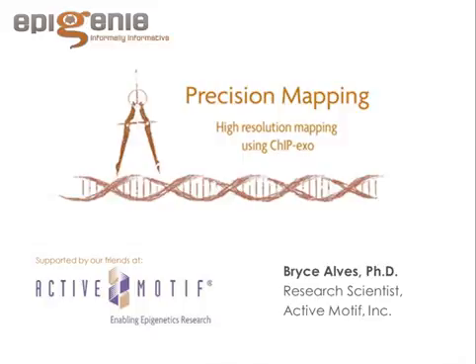So the next question is: do you also include the RecJF step? I'm sorry, I'm not an expert on that. Yes, the RecJF exo step in addition to the lambda. Yes, I do. For simplicity of this talk, I left that step out just to keep the talk rolling along.